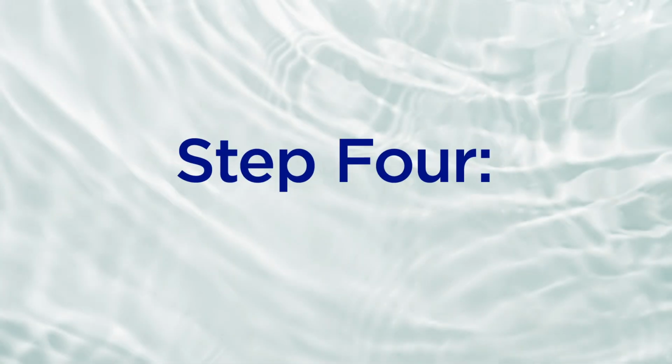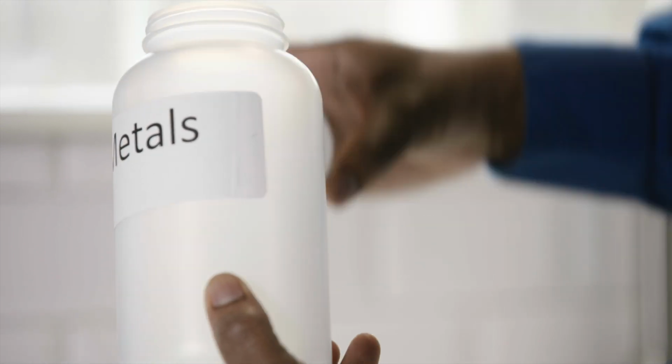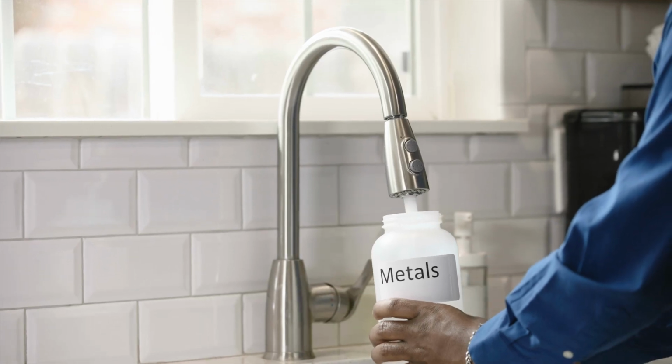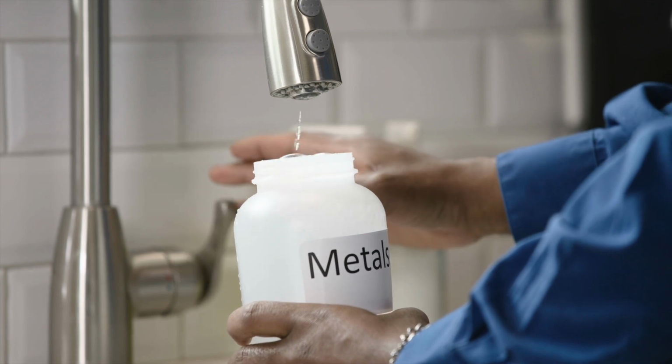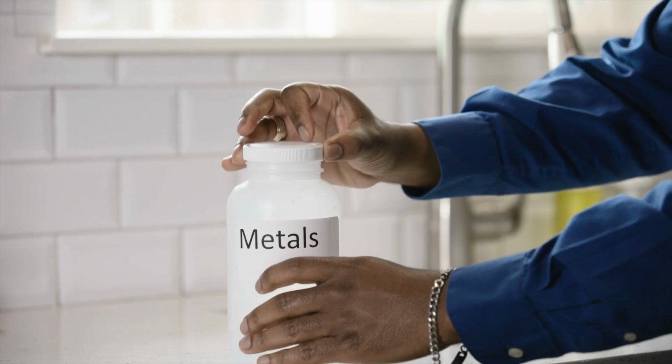Step 4. When collecting your water, avoid sampling from locations that have filters. If this is not possible, then remove or bypass any filters on the faucet, but leave the aerator or screen on the faucet. Remove the lid of the 1 liter bottle, then turn the cold water on so it flows without splashing. Fill to the line or the neck of the bottle with water and immediately screw on the cap.